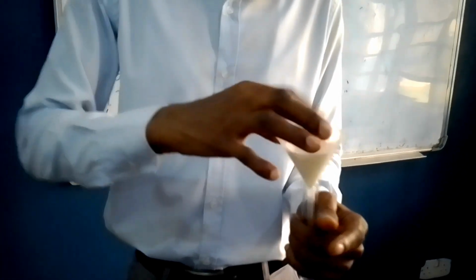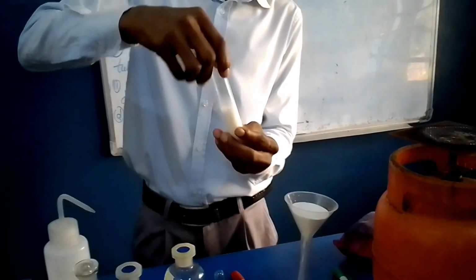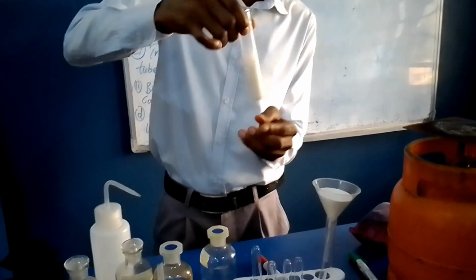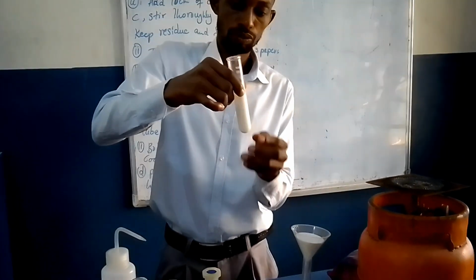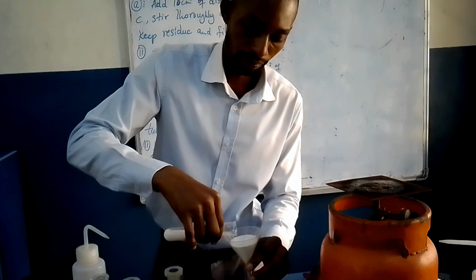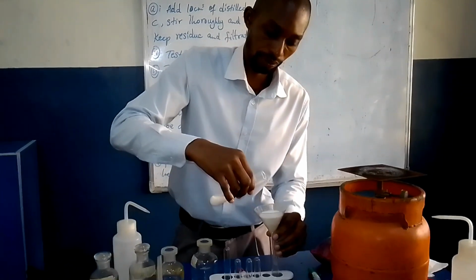It will also help the filtrate to move faster. Then shake very well, shake vigorously to get a homogeneous mixture, and then pour gently to avoid overflow.